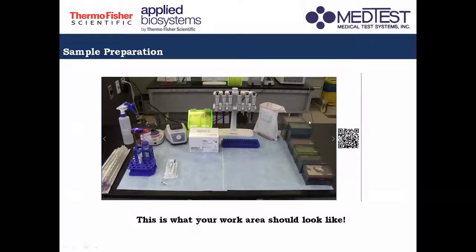So next week, I will discuss to you each of these consumables as we try to process certain samples for the Kingfisher and your qPCR instruments. But basically, ito po yung dapat magiging setup po natin.